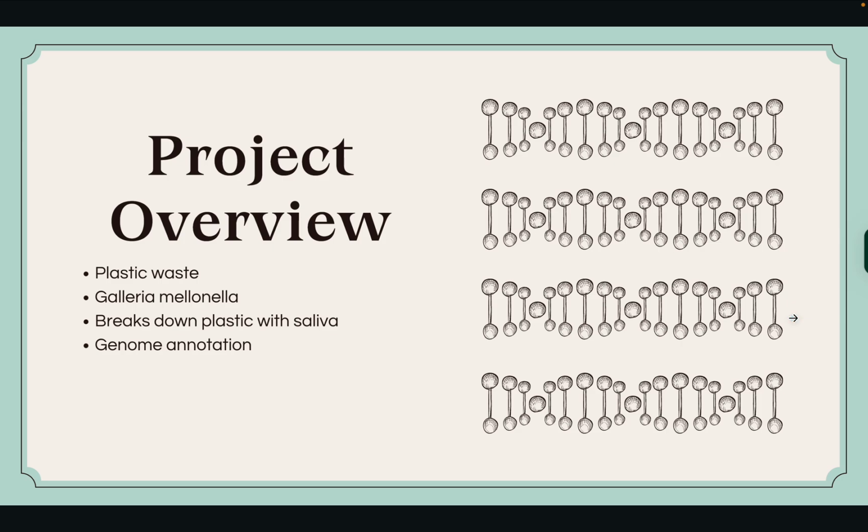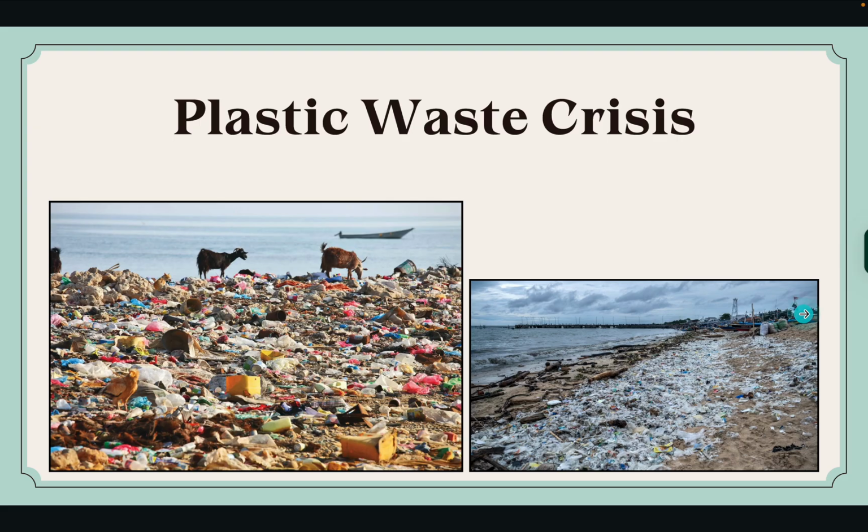So, during our lifetime, there has been a significant increase in plastic waste, causing environmental pressure around the world. In NC State's Genetics 312 lab, we focused on annotating the genome of a larval moth that has the ability to quickly break down plastic with its saliva. We used technology and biological data to annotate the genome to find the specific genes that allowed the waxworm to quickly degrade plastic. This information is crucial for future research as it can help address environmental issues.